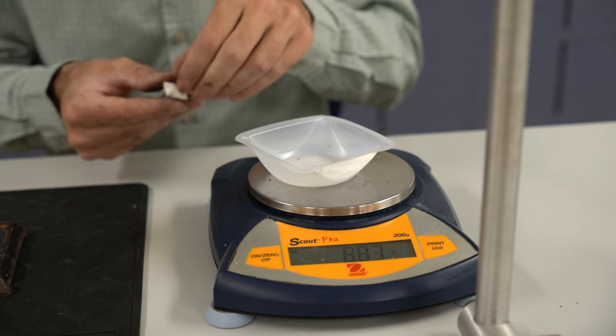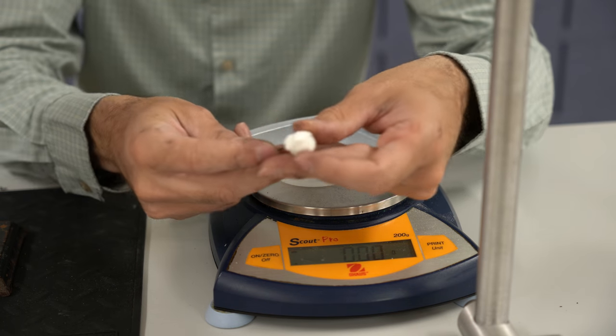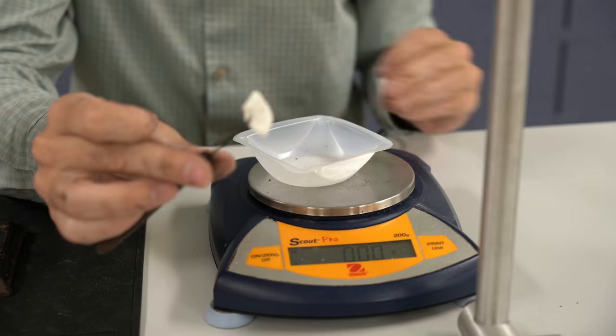So now we've got that, we're going to take our food item, take our wooden skewer, and very carefully, we want to be able to go through and attach that right there. Okay? That's what we're going to use for our next step.